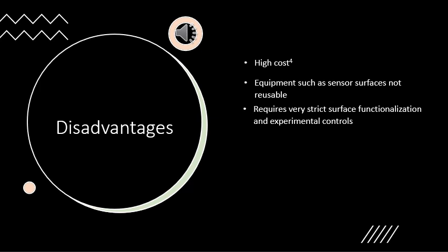This is also why reasonably high concentrations are essential for SPR, as low concentrations can lead to inconsistent rates of binding and microscopic or irregular changes in refractive index. Irregular changes due to inconsistent binding will give results that do not accurately represent the behavior of your sample, and extremely small changes in refractive index can fall under the machine's noise level, thus giving false negatives.